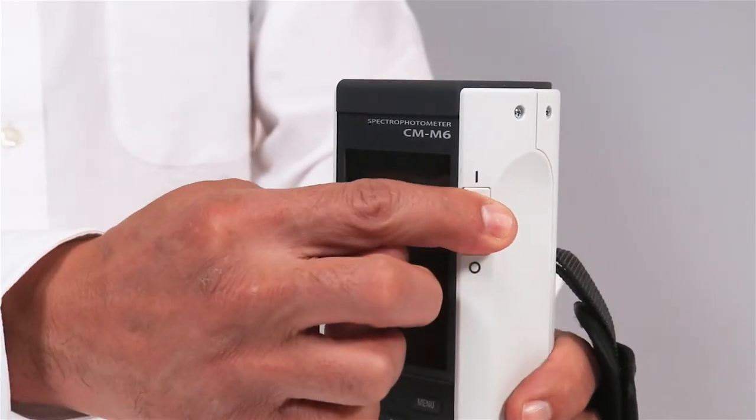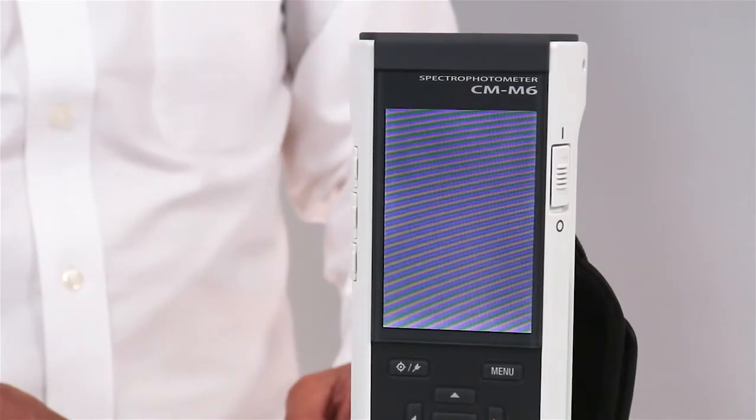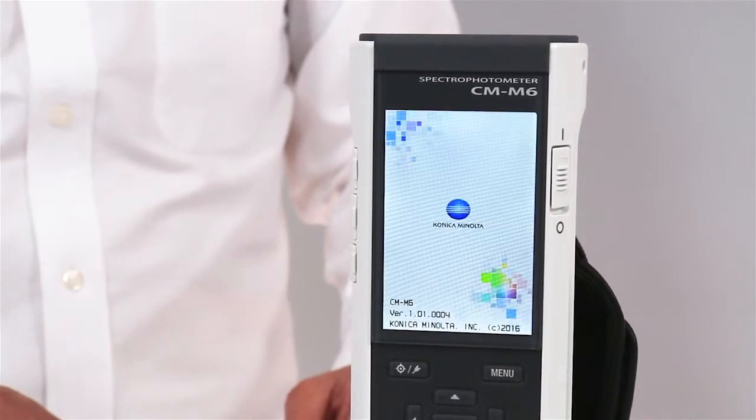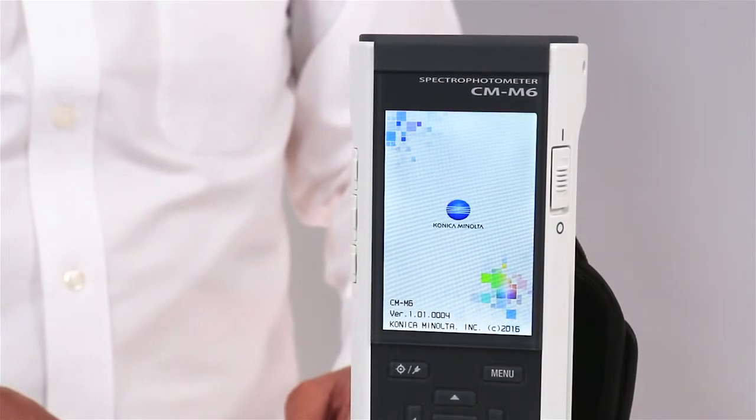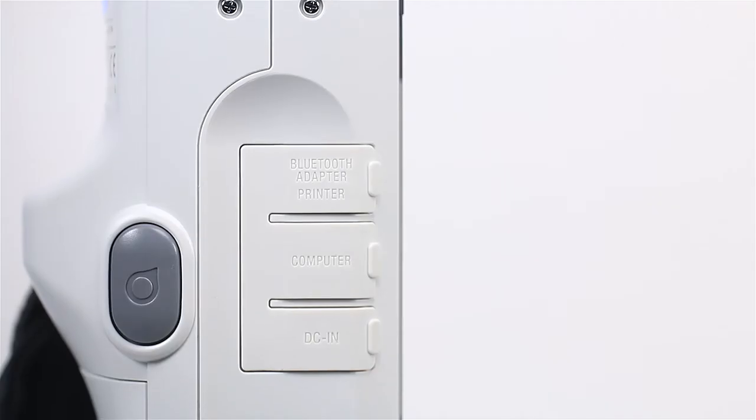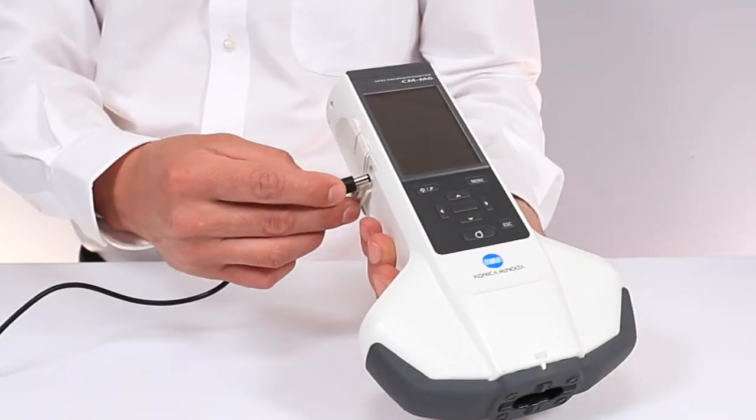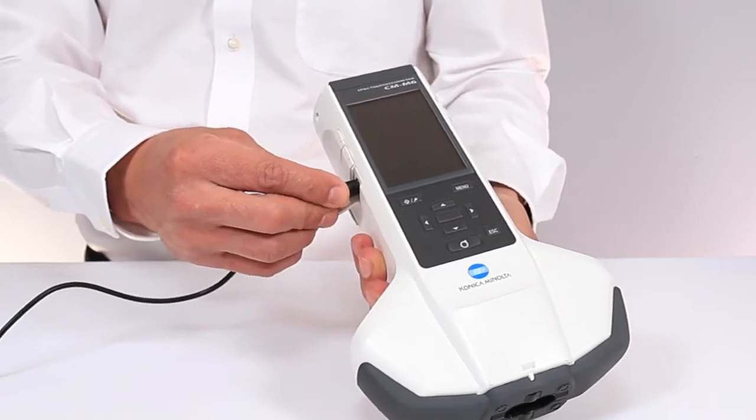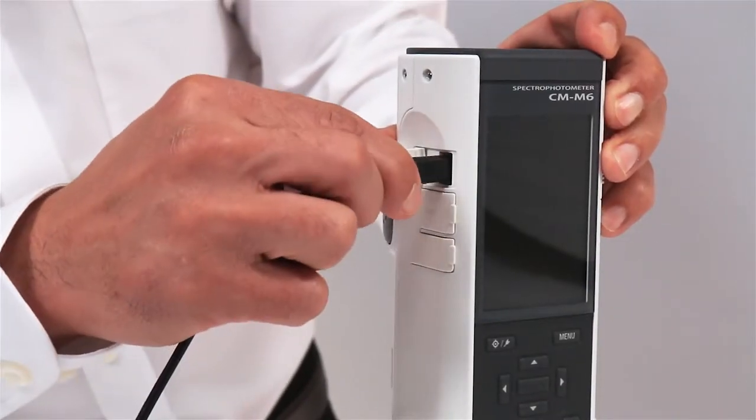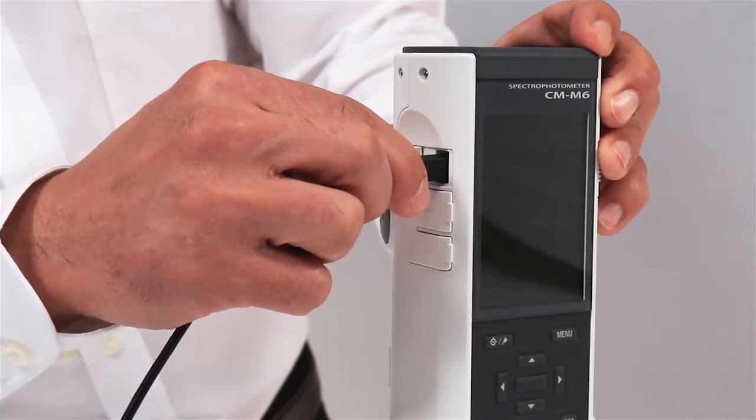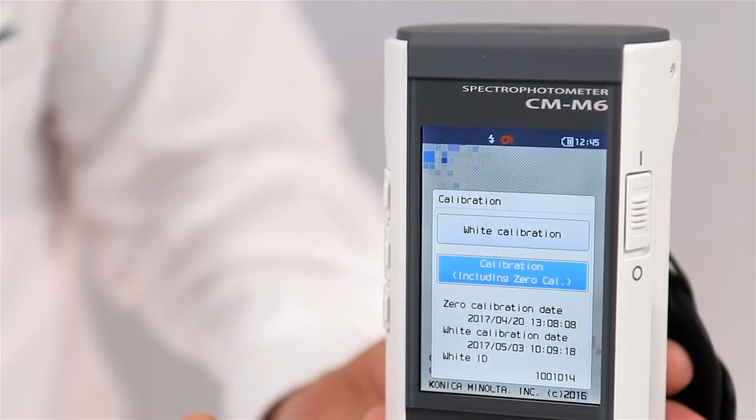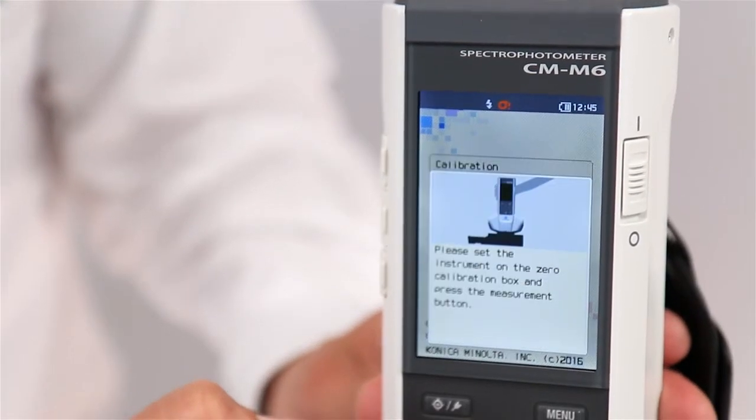To begin measurement, power the CMM6 with a chargeable battery, AC adapter, or USB cable. Then perform a zero and white calibration.